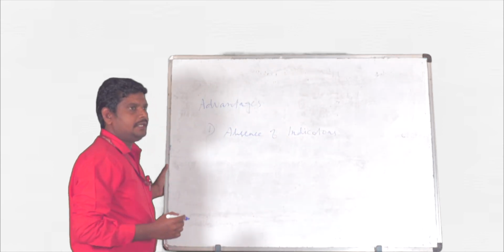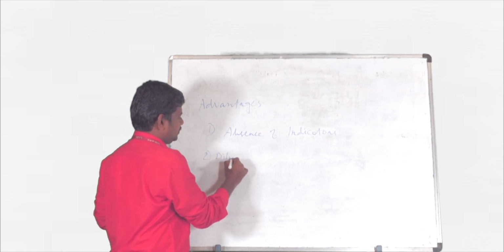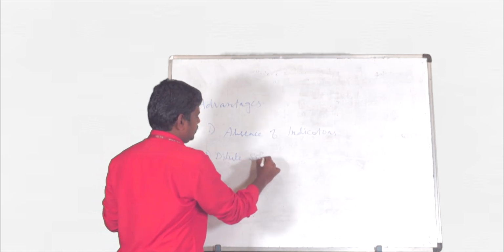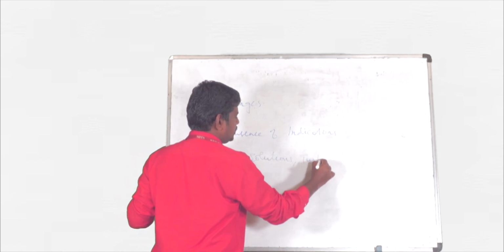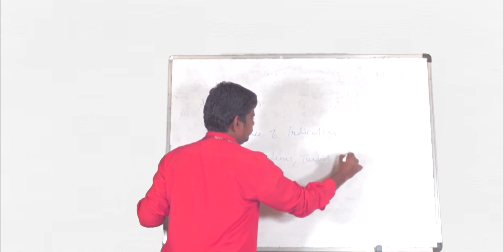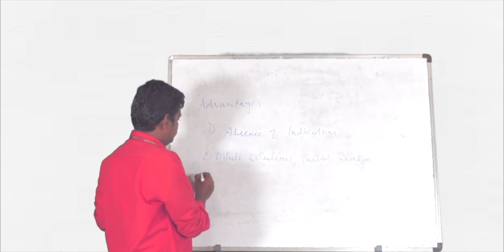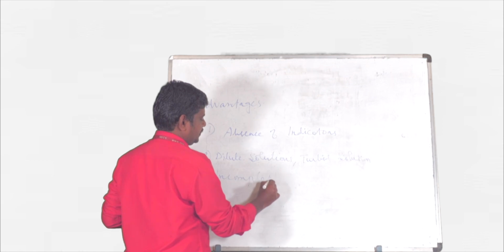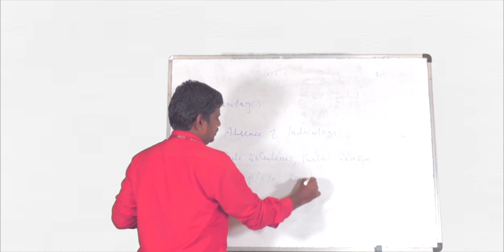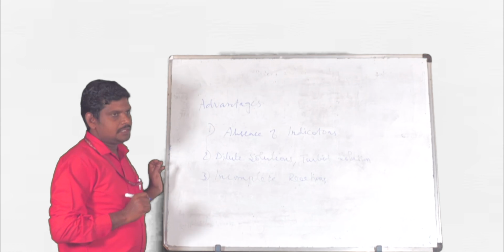It is suitable for dilute solutions, turbid solutions, and in addition to that, it is suitable for incomplete reactions.